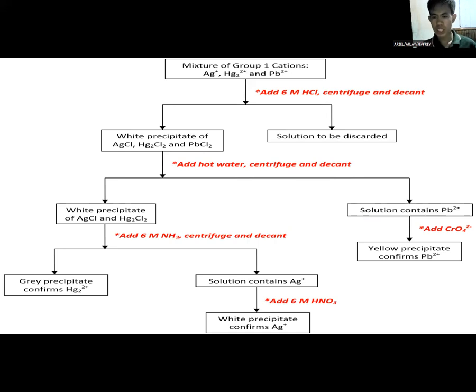What happened really here is that the lead chloride is separated into two. As I mentioned earlier, it just returned back into being an aqueous solution, which means that it will return back into being lead cations, and then the chlorine that was present a while ago will also be separated and will also be in the aqueous solution.